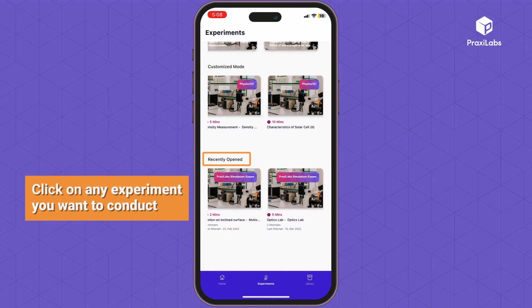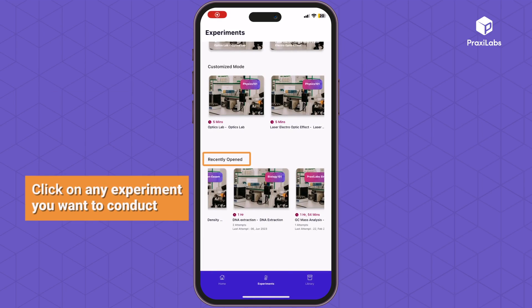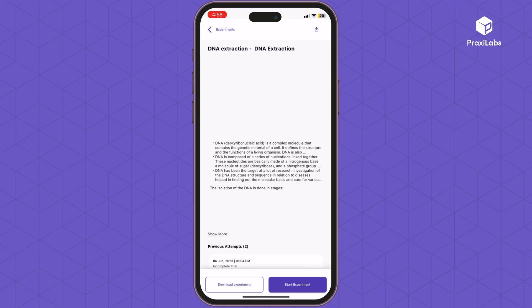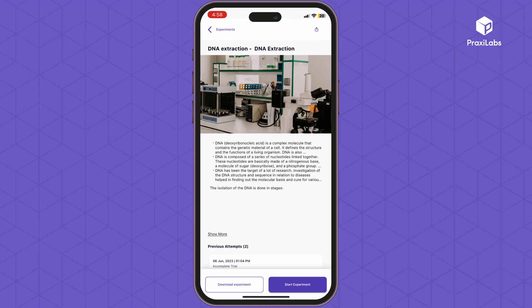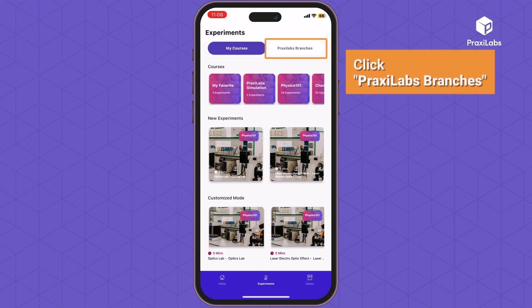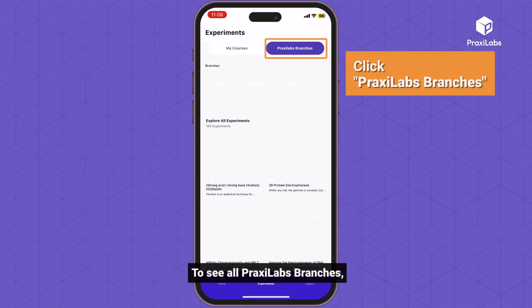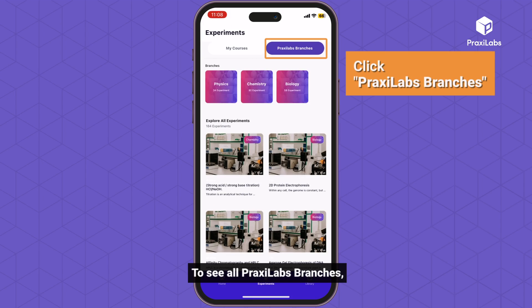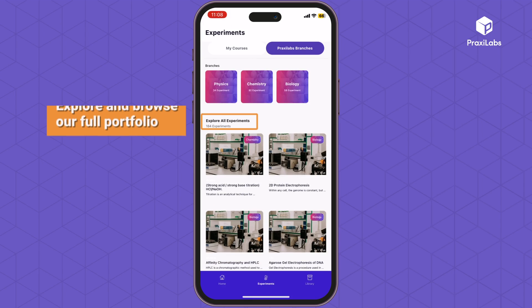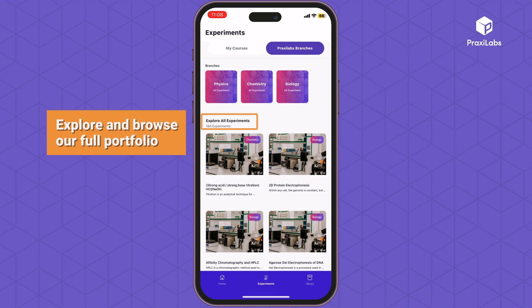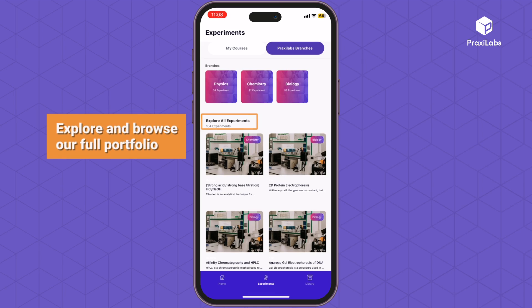Click on any experiment you want to conduct. Click Praxa Labs branches to see all Praxa Labs branches and explore the full experiments catalog. Explore and browse our full portfolio.